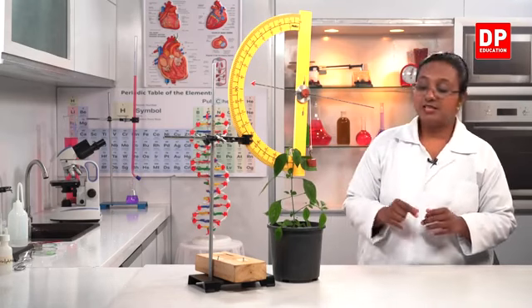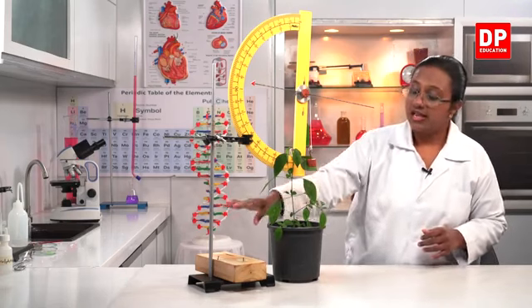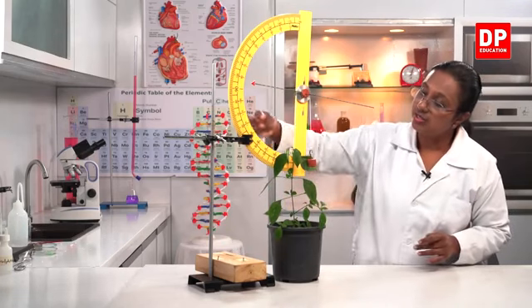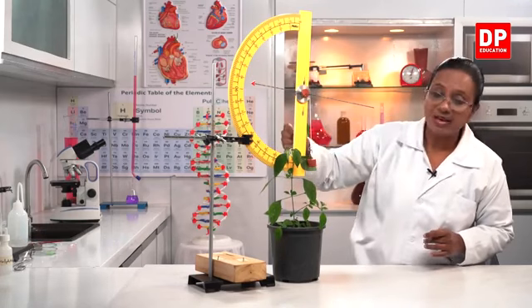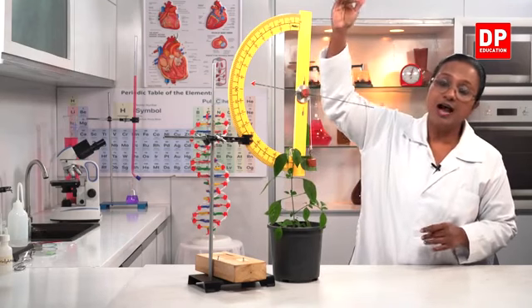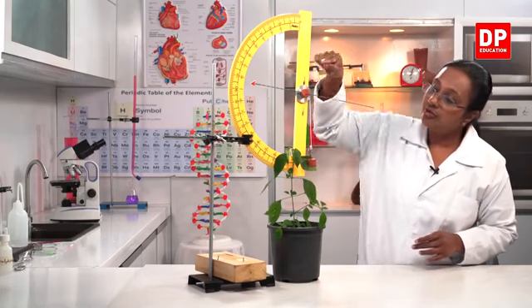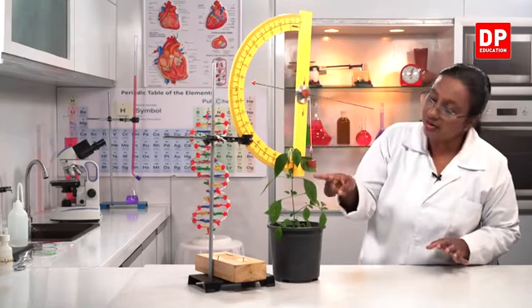So here these are the things that we need. We need a potted plant which is used to observe the growth, and here you need a stand. We have used a burette stand that you can get from the lab, and here the scale is a wooden scale that is fixed here, and the wooden scale has this plank. Normally you are supposed to connect this pulley to a higher support so that it doesn't move downwards, but here since we have this plank, the pulley is attached here, and to the pulley you can see the indicator attached to it.